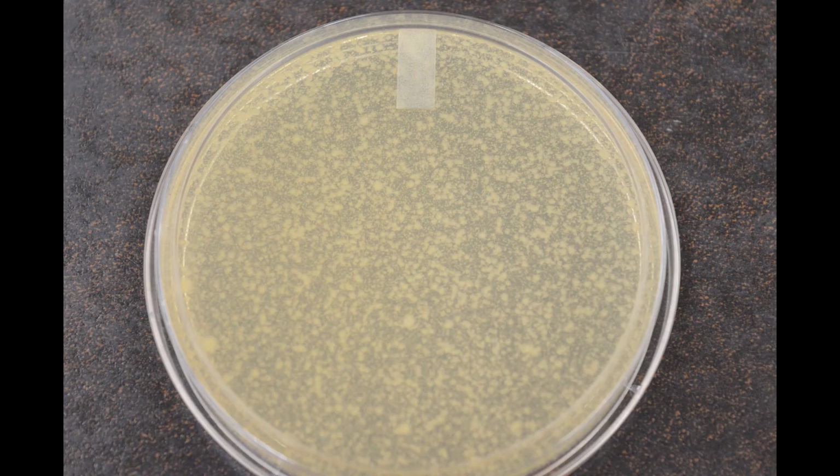The end result may look something like this, depending on the concentration of cells in the original sample. This plate shows individual colonies that are each derived from one single cell, but they are growing so close to one another that some colony overlap is possible, and that it would be very difficult to try to remove one colony from that plate without touching another. In this case, you would repeat the procedure with a more dilute sample.